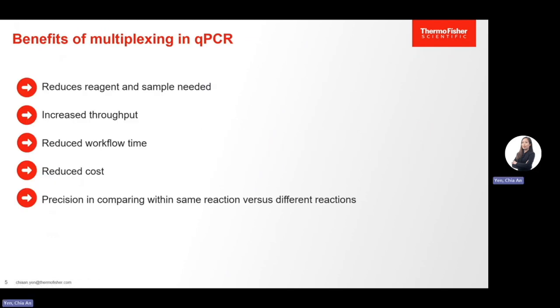Now that we've gained a better understanding of how multiplexing in qPCR works, it's time to go into the rationale for considering this approach. So what are the advantages of multiplexing in qPCR? Imagine you're working with samples that have low yield.